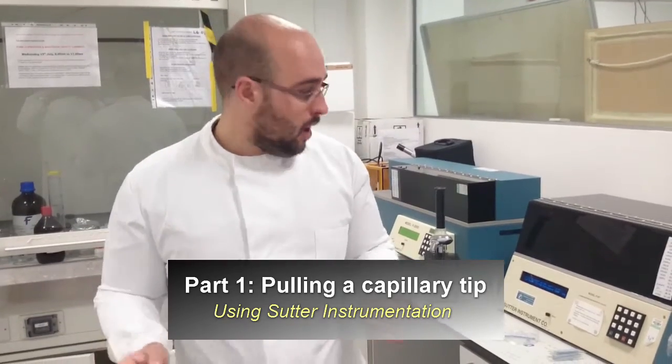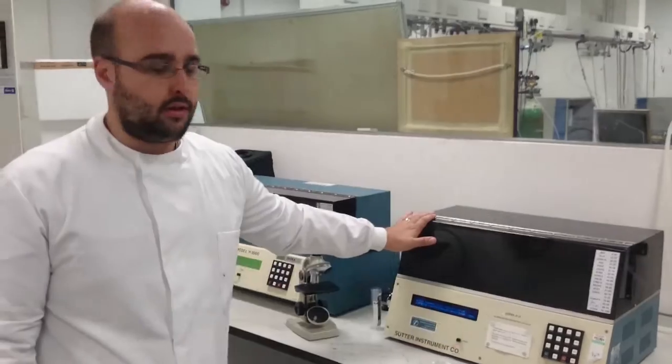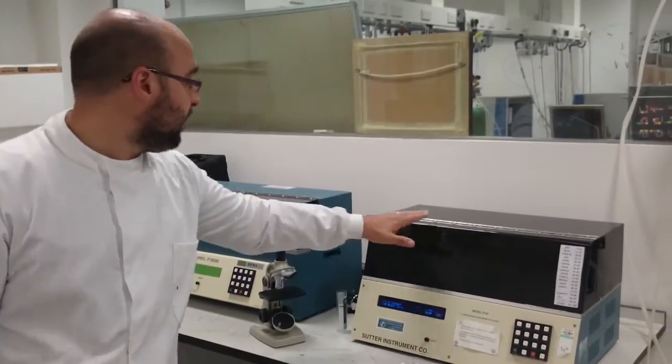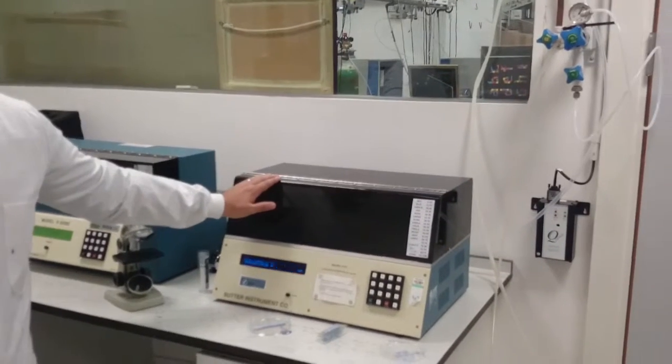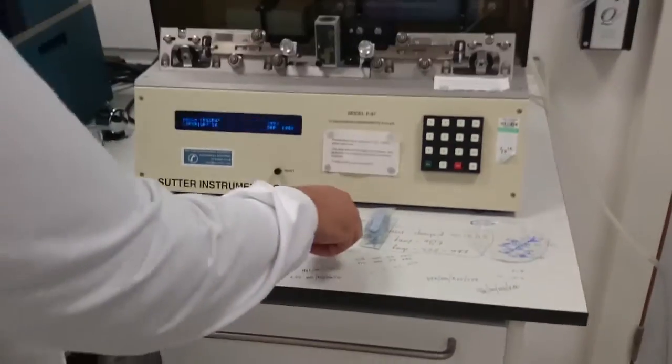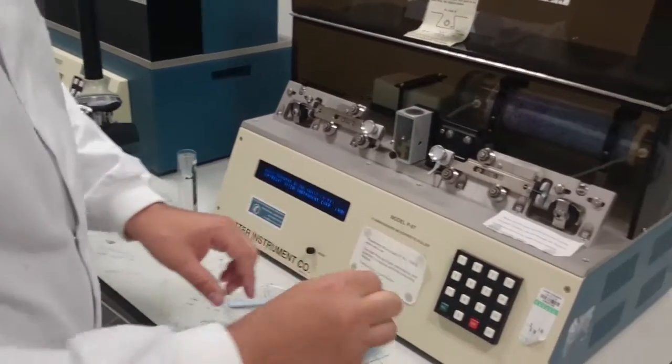I'm going to start off by showing you how to pull a borosilicate glass tip. We're going to be using the Sutter instrumentation, which is a common tip pulling source. Here we have both the filament and laser models, and I'm going to be showing you how to do it on the filament system. The borosilicate glass tip comes intact like this, and I'm going to pull it into two separate tips. We'll end up with a pulled glass tip like this.